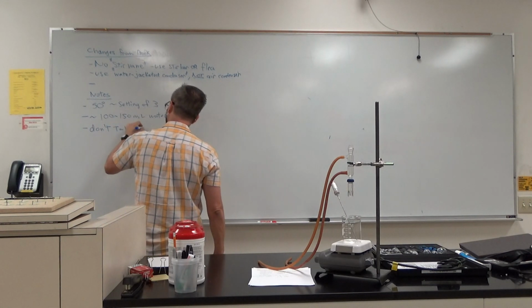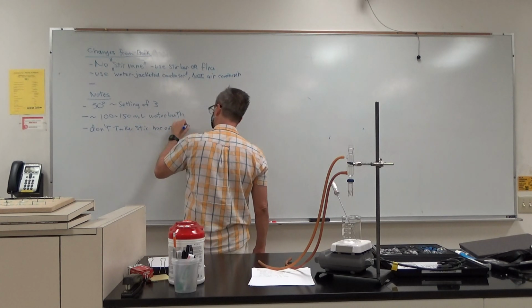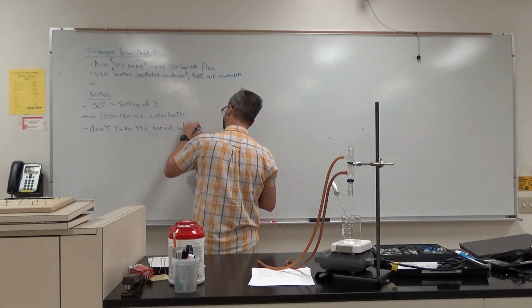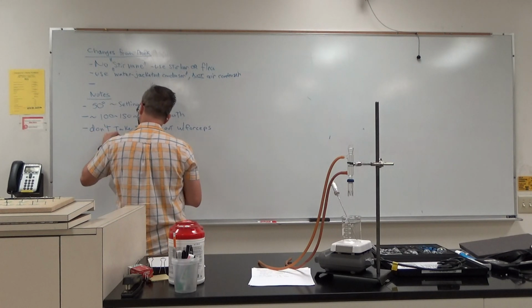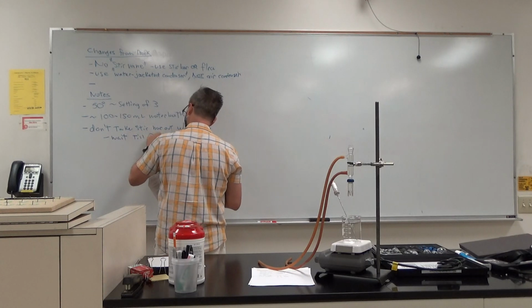Don't take the stir bar out with forceps. Okay. Wait till filtration.